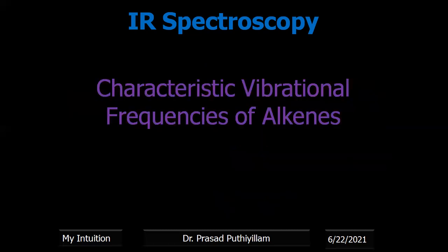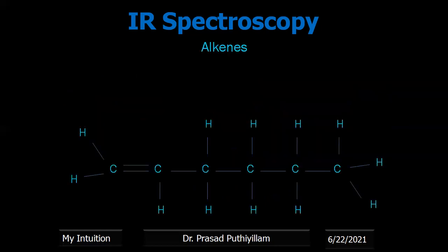Now some characteristic vibration frequencies of alkenes. So that's about alkanes. You can take different alkanes, compare their frequencies, and you will be getting peaks near to that. So in alkenes, alkene means having a double bond.